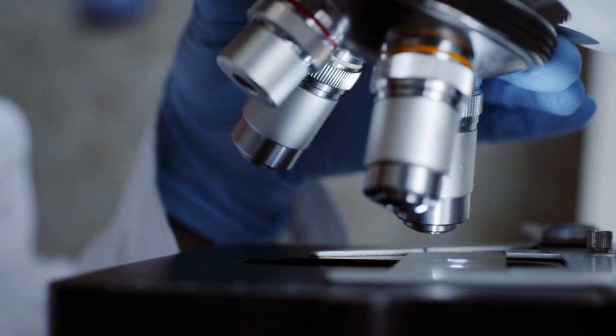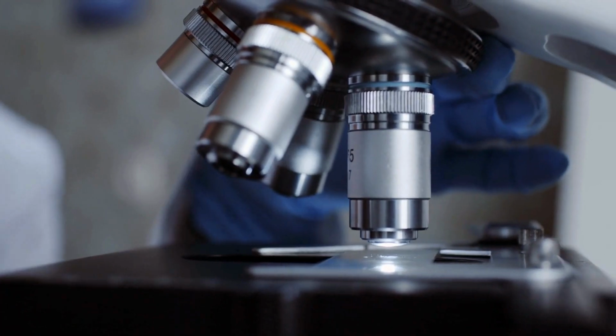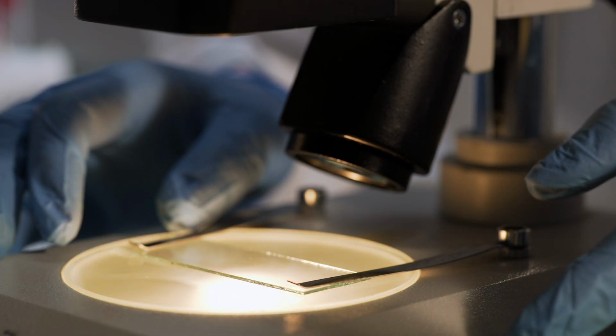So biologists a lot of time have to deal with thick samples, so thick that they may not be suitable to generate informative results or high quality images. If you're using a regular fluorescent microscope, a light microscope, the sample is so thick that there is a lot of out of focus light coming from various layers of the cells that all reach the microscope and go through and reach the camera at the same time. And there is so much information that all you see is a blurry image.